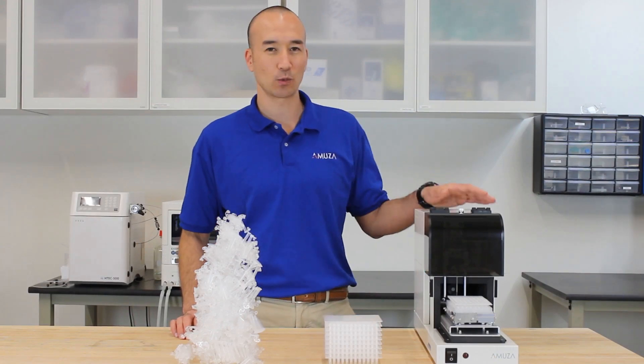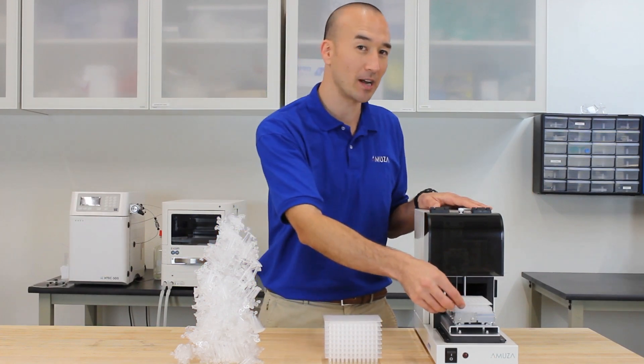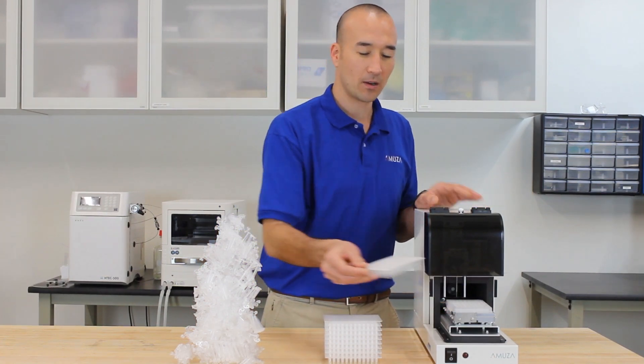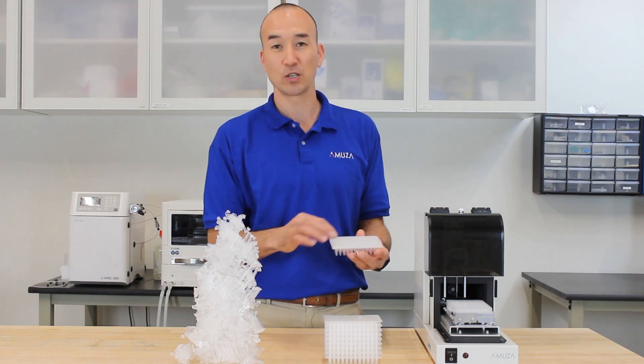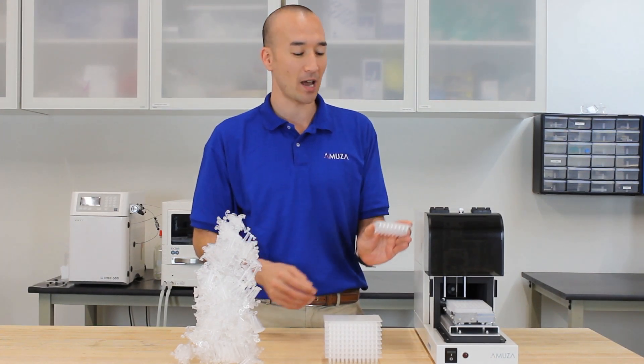Hi, I'd like to show you how using 96-well plates with your fraction collector can save you a great deal when collecting microdialysis samples. Are you familiar with 96-well plates? Because they're individually labeled and they all come in one piece, it can save you a great deal in a lot of different ways.